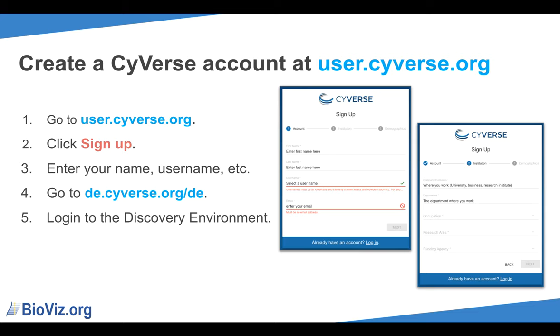To create an account, go to user.cyverse.org and click Sign Up. It will ask you for some information such as your name and email, along with some general demographic information such as where you work. Once your account has been created, you can go to de.cyverse.org to log in to the Discovery Environment.